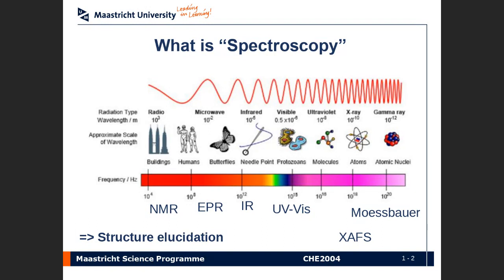But we are using the electromagnetic spectrum, and we are using some instrumentation and seeing how certain parts of the electromagnetic spectrum interact with a molecule or a molecular entity or a solid, the chemical species that's under investigation. And using this interaction between the electromagnetic spectrum and the molecule, you can glean some information that helps you understand what the three-dimensional structure of the molecule is.